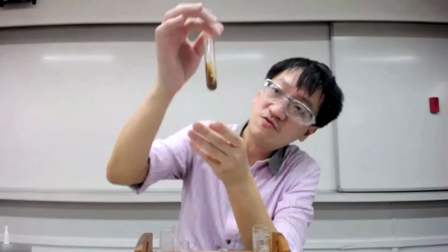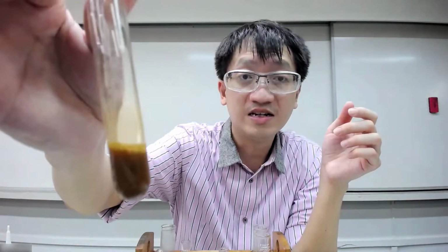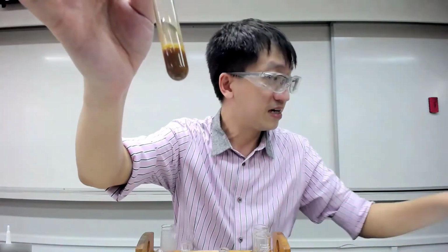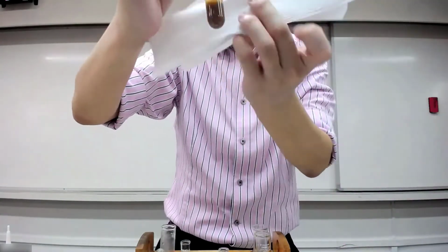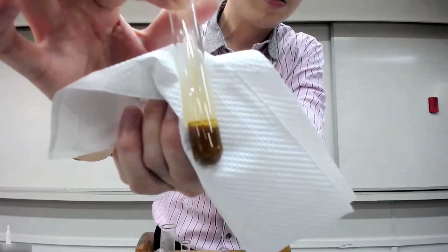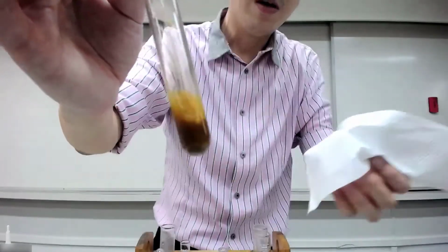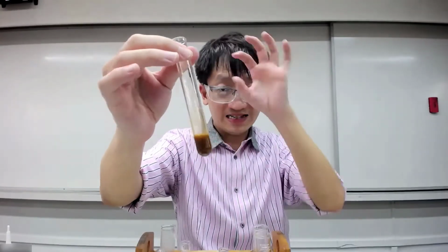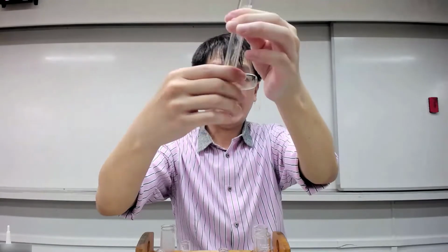If you want to observe, a very good telltale sign is to look at the side of the container, I mean the side of the test tube. Just now I was telling you, the side of the test tube. So maybe I can use this. We can get a clearer look. The side, so it's a bit white, because copper 1 iodide as a PPT likes to stain the walls of the container, especially test tubes.